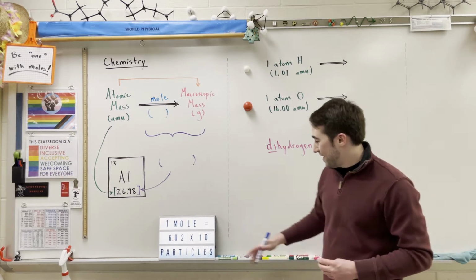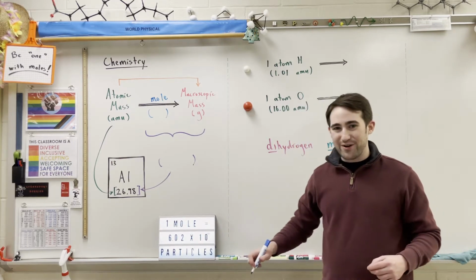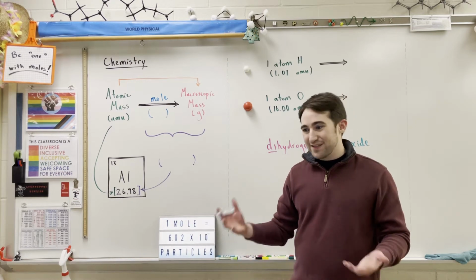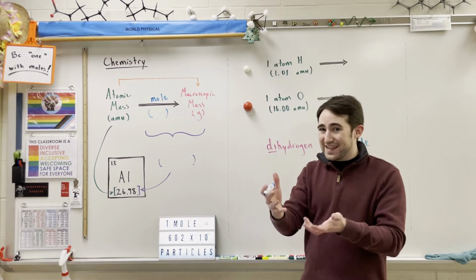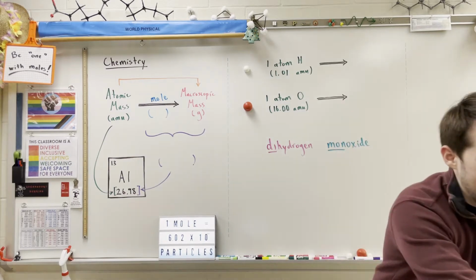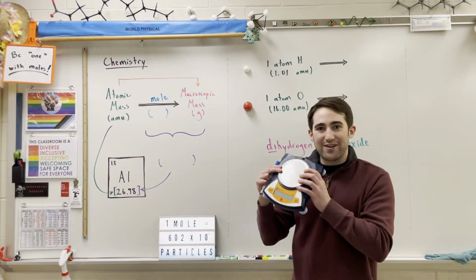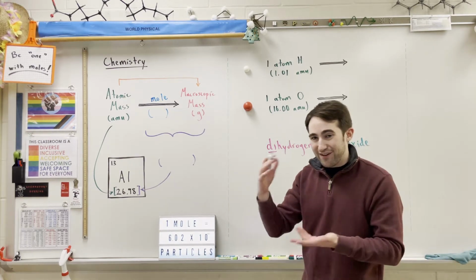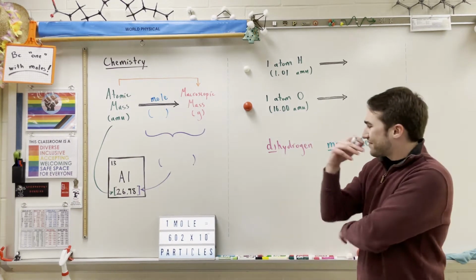By the time you have 6.02 times 10 to the 23rd atoms or molecules of something, you start dealing in amounts that you can measure pretty easily, using something like a mass balance like this, or a graduated cylinder for liquids.